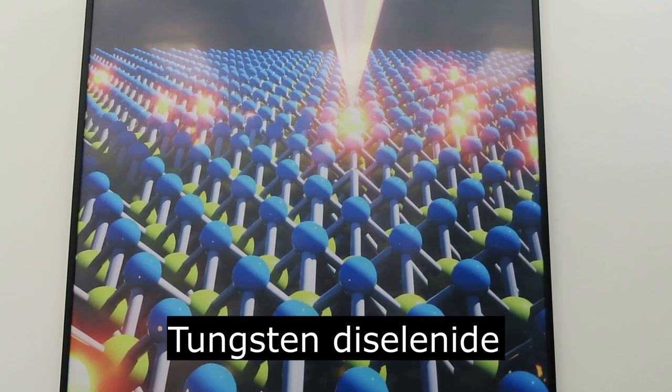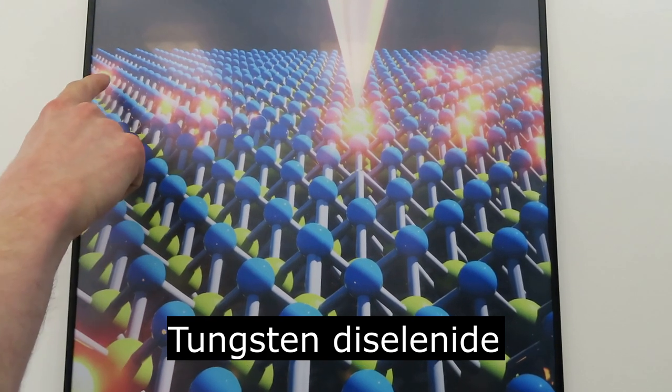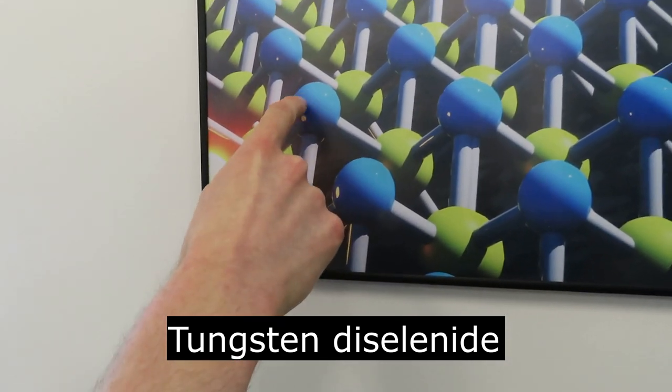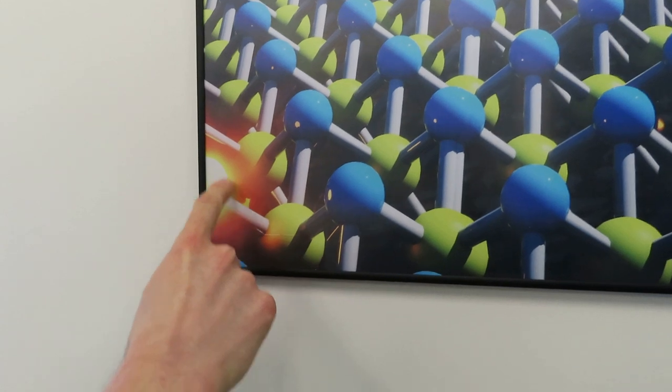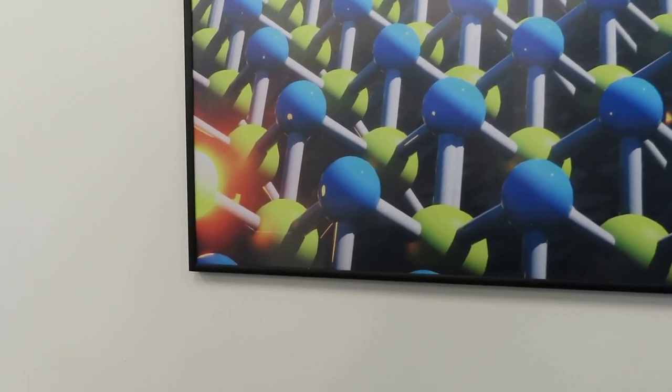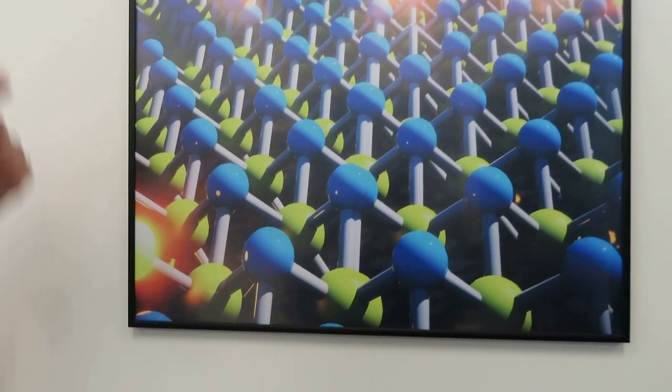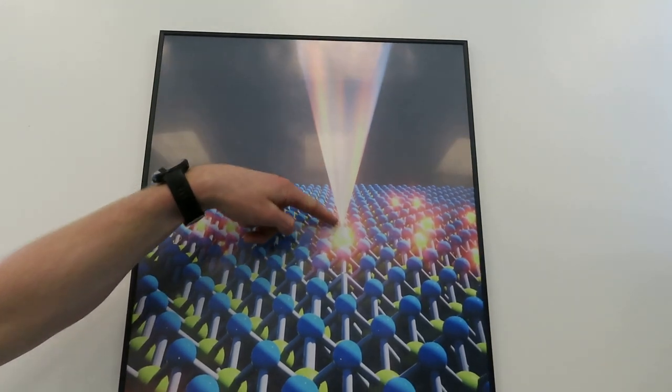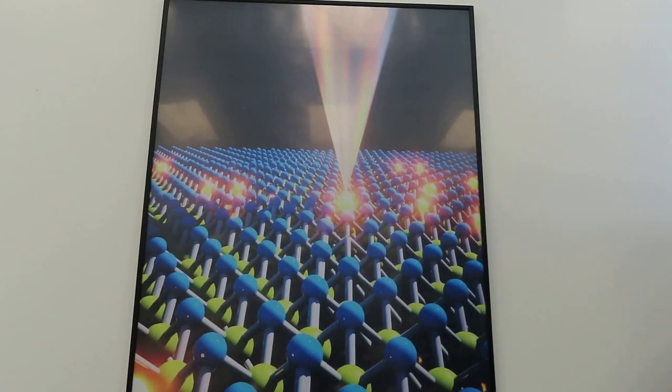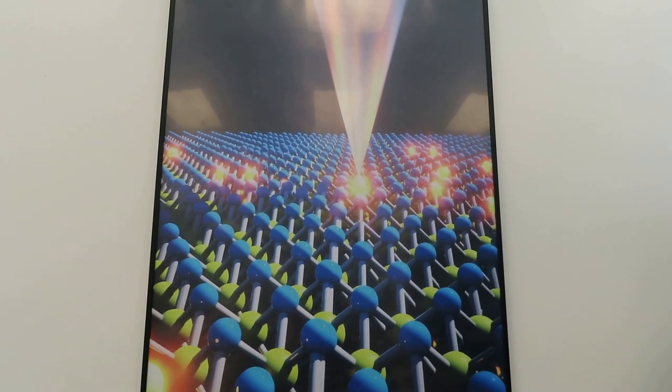You can also have substitution defects, so for example over here, instead of one of these selenium atoms, you have some other atom, maybe an oxygen atom that's replaced it. There are different kinds of defects, but these are a few that happen in this material. What we can do with our STM is bring our tip very close to one of these defects and we can study the effect that that defect has on the local electronic structure. Wow, that's amazing.